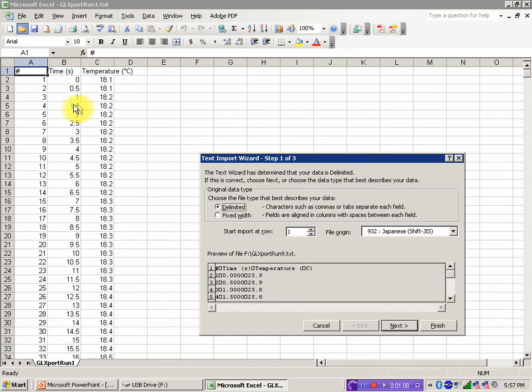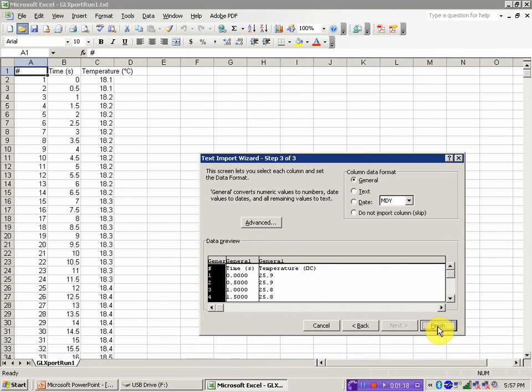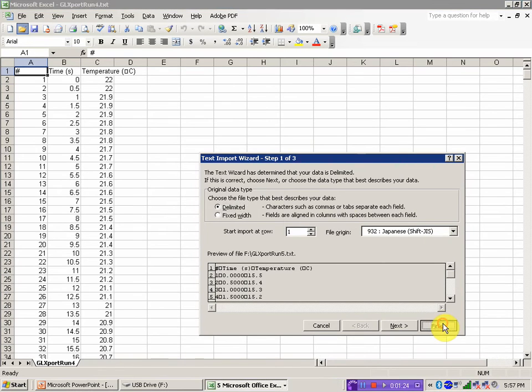Open. If you open in this setting, it's going to have a text import wizard. We want delimited files. It's tab delimited, and then we can go ahead and finish that. You can also just click the finish icon in most cases and these will all open up.